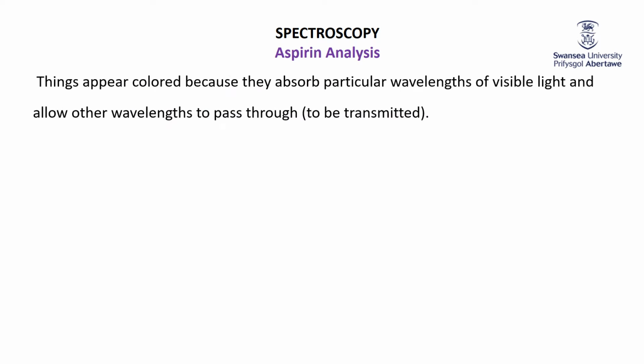So the second experiment in our Swansea Analyst contest for this year is all about aspirin analysis by spectroscopy. The actual experimental part of this is dead easy. It's the calculation part that can take some time, and it's also worth spending a little bit of time introducing the background for it.